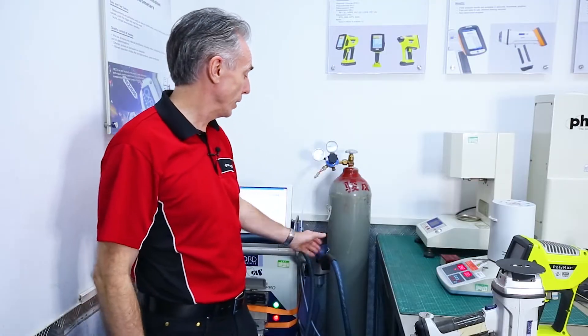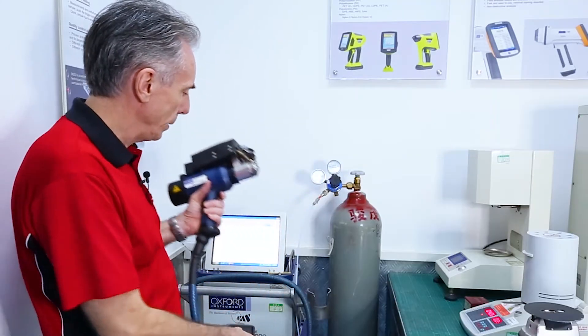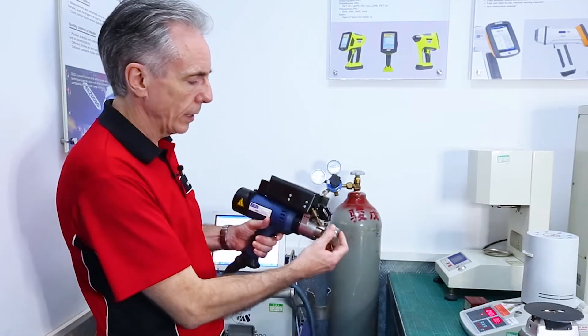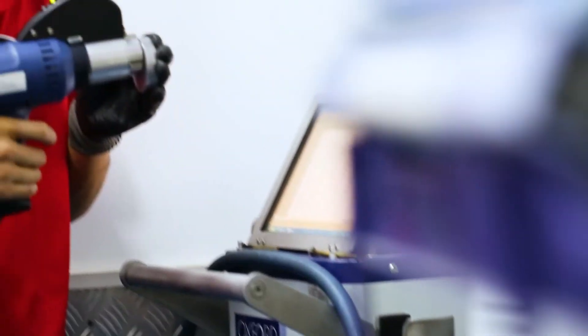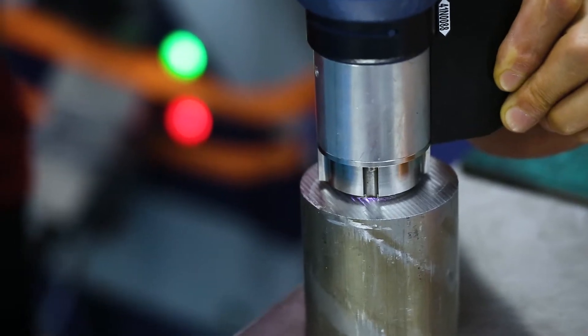The first machine I'd like to show you is our optical emission spectrometer. This is the gun and this is the body of the machine. You put this onto the metal, pull the trigger, and it sends what looks like a stream of sparks at the surface.